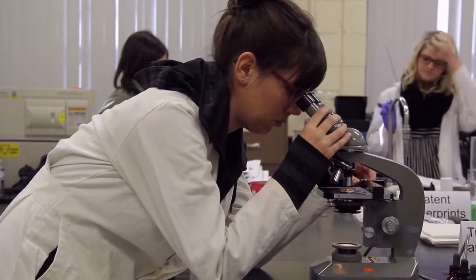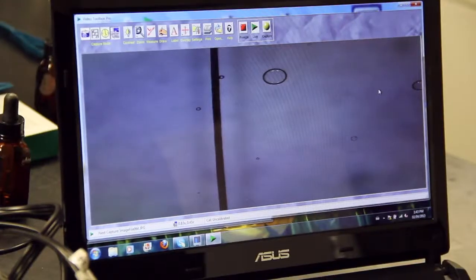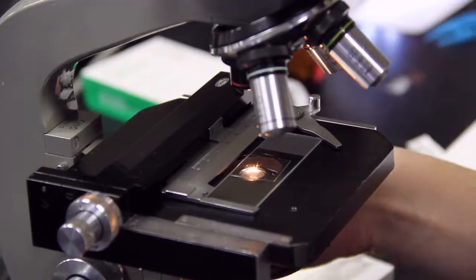Microscopes can be used just by looking through them. You can identify the different species based on the structure of the hair. So that's what we're teaching them today.